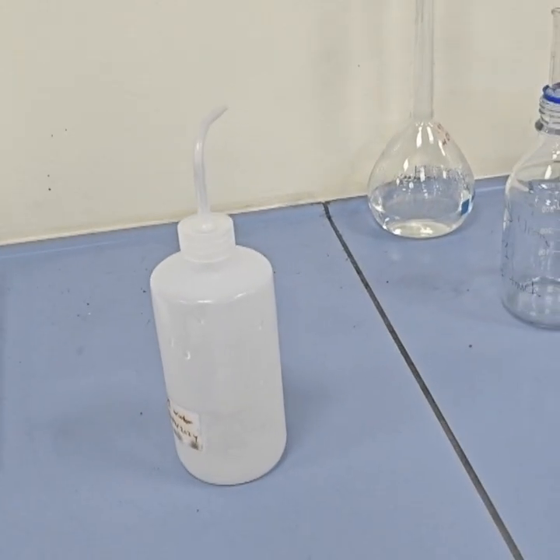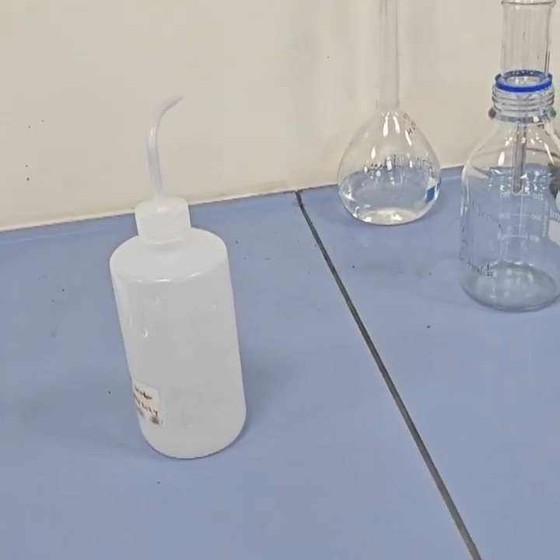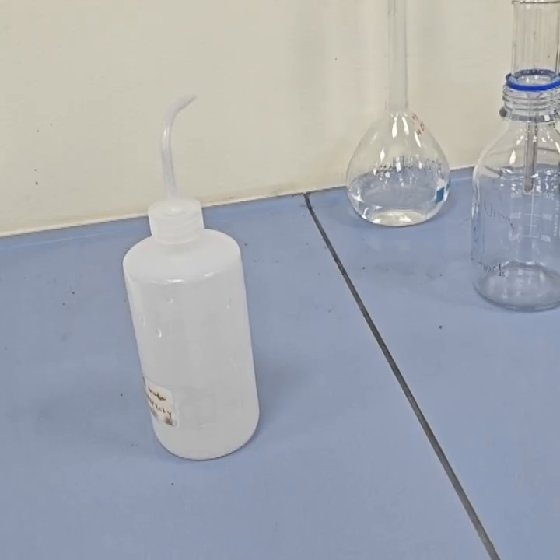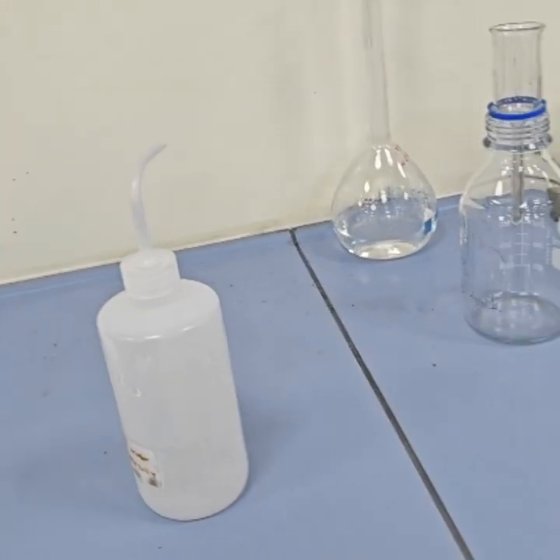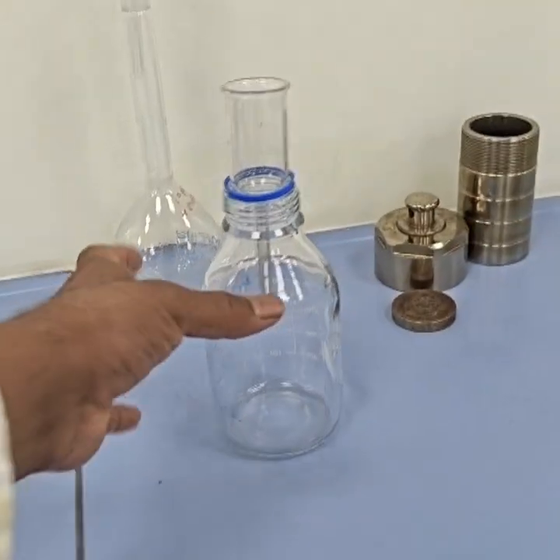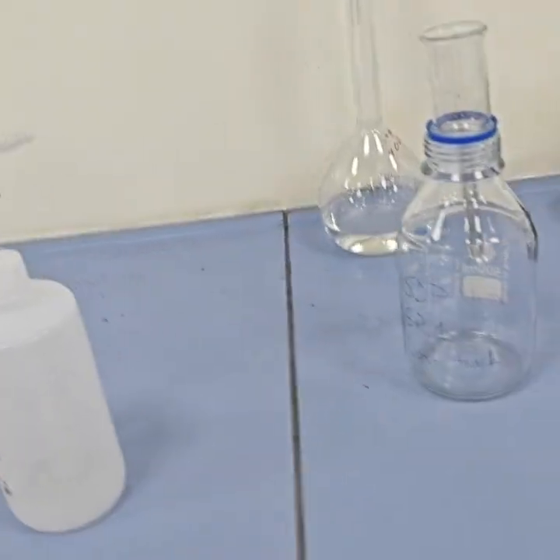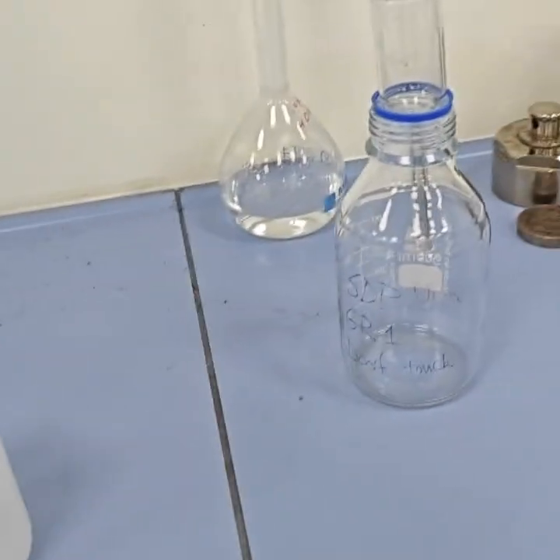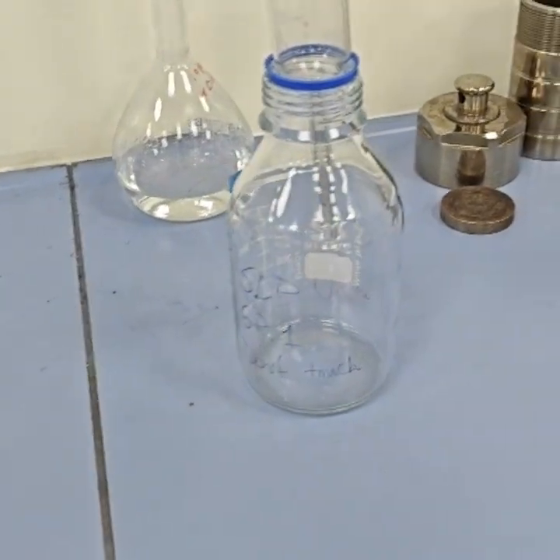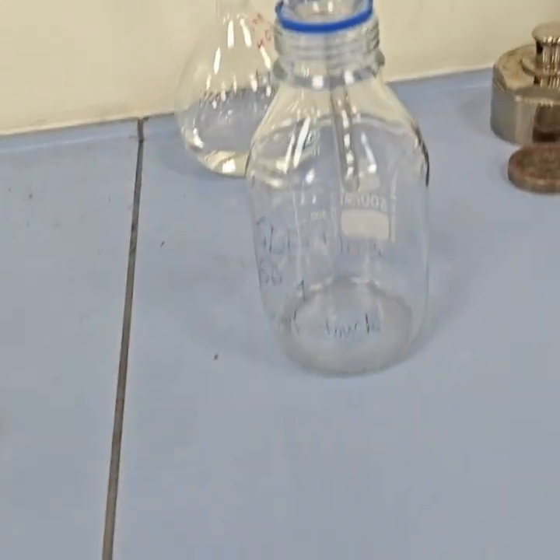Okay. Now for quality assurance and documentation, you must record the time, date, location, collector, and preservation, and ensure all the bottles and caps are clean before doing the test. This is as per APHA SM 1060. And rinse the bottle with sample. Before you collect the sample, for example in this bottle, you must first wash with tap water. And if you are doing metals, we will be washing with acid, a specific concentration of the acid. And also make sure before collection you rinse with the sample once.